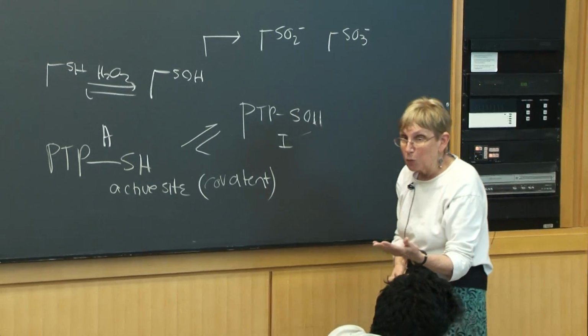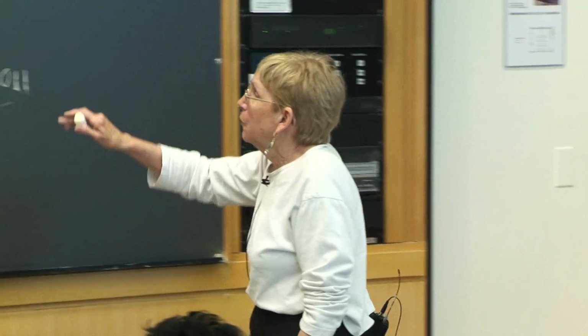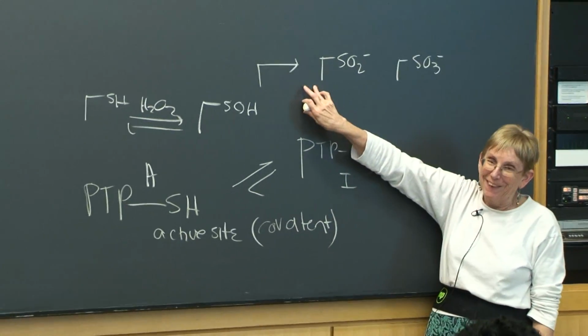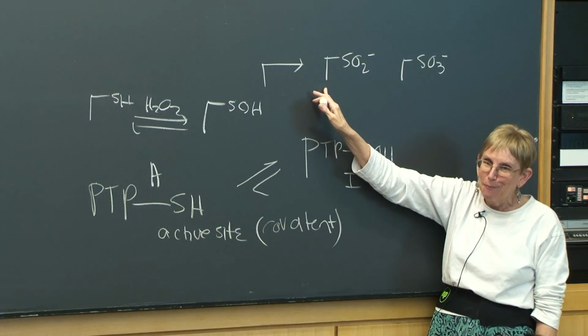Say you thought that this was happening. I mean, we're missing a lot of stuff. So there's a number of explanations. That's just one of them. So what method are we using? Mass spec. Yeah. So how could you distinguish this from this? By mass.